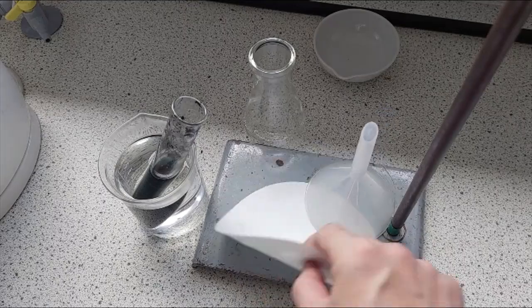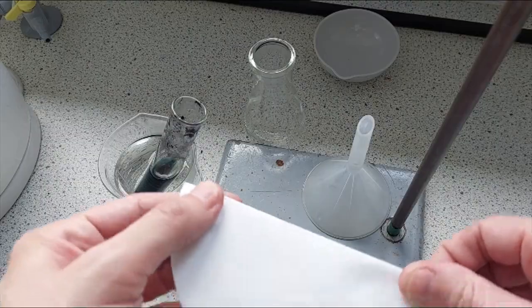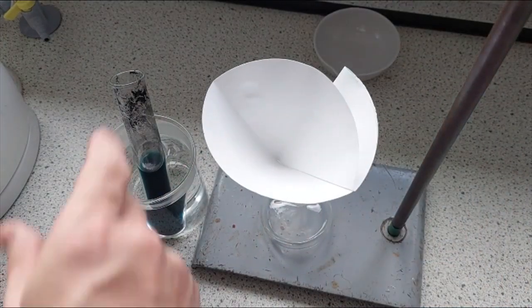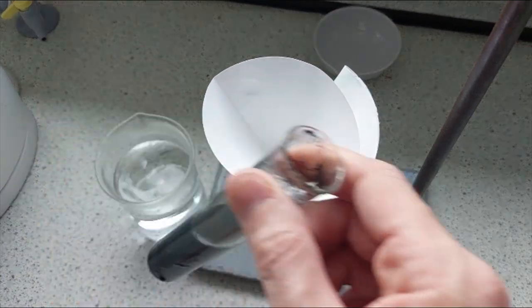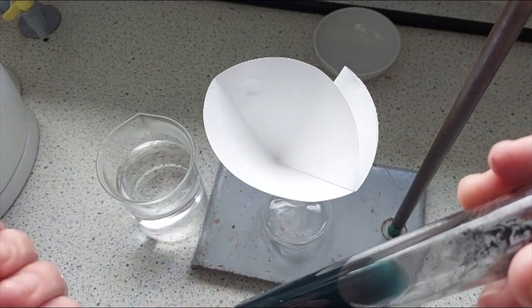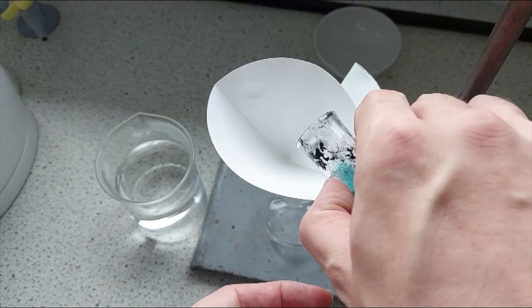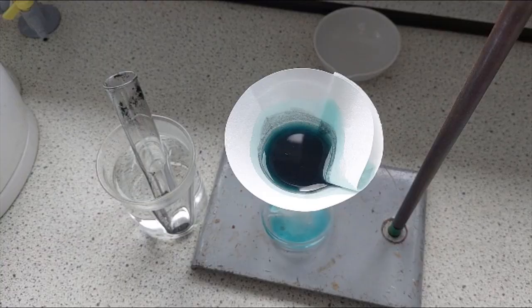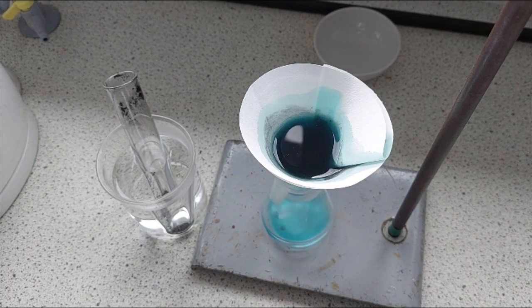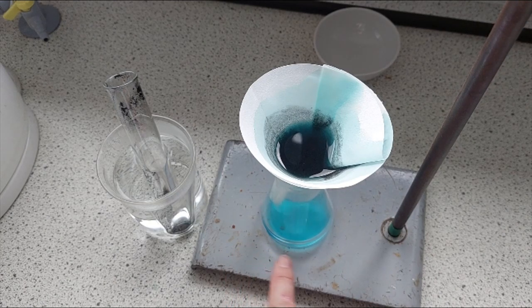Now filtration relies on a piece of filter paper, which I'll fold in half twice. We've got a conical flask there, which will be nice to sit our filter paper in. And we take our mixture here. Remember, this now contains no sulfuric acid. It should have all reacted. Shouldn't be any in there, so it's safe to evaporate afterwards. Gently pour that in. So I'll just move this to the side a little bit. You should be able to see at the bottom there, it's coming through nice and clear blue color. So we're going to allow that to filter through, and we'll collect it all at the bottom.